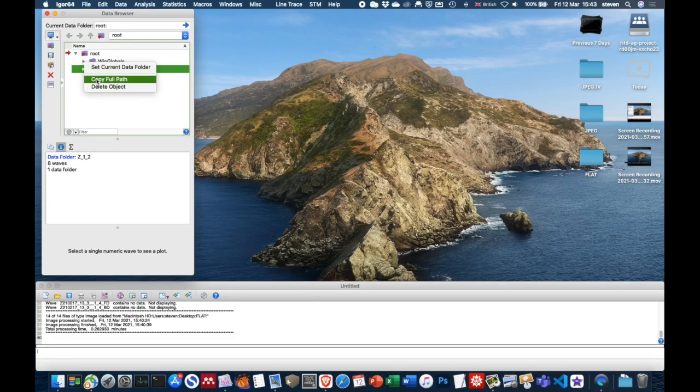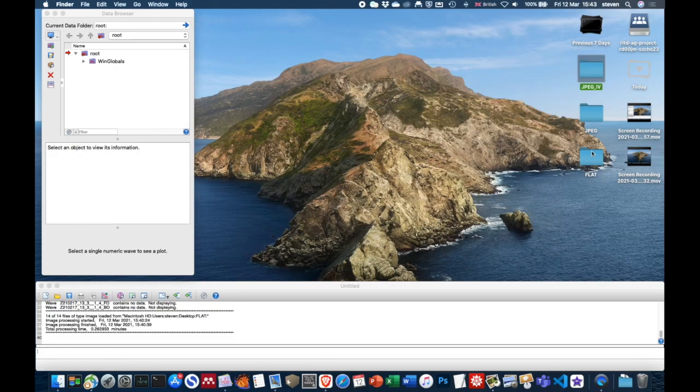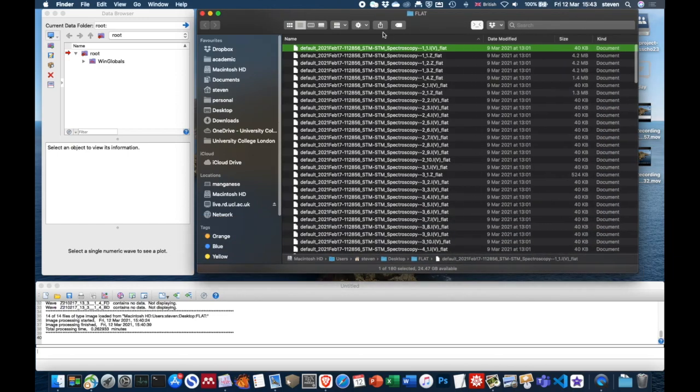Okay, so now I guess it's time to finally start looking at the spectroscopy data. So I'm going to open up the flat file directory, and you see here, remember I did one single point spectroscopy measurement first, and that's why this first IV file is 1_1. So there's only one. Every time you click or activate the spectroscopy, it'll increment this first number.